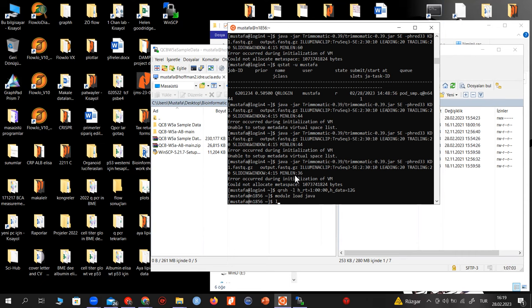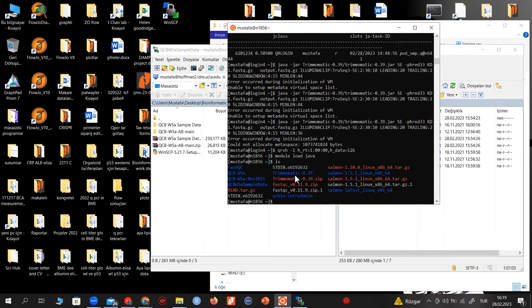Should I enter this sample data? So where is your data? Where is your software? Actually here. Okay. So software meaning the Trimmomatic one? It's just here actually. I did not create any subfolders. Okay, it's okay, but since all of this is here, start typing out the Trimmomatic line here.